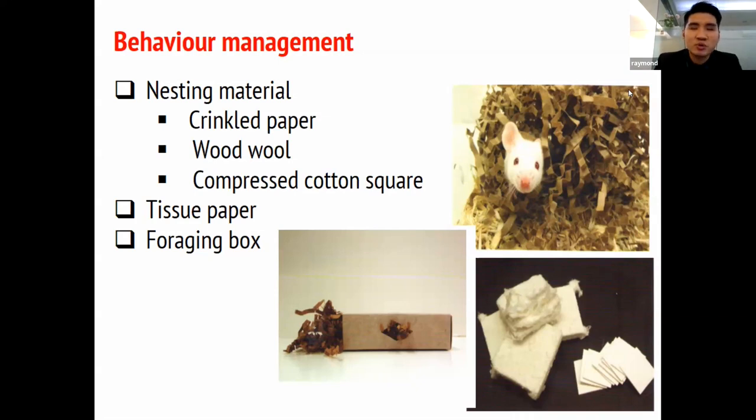So if we would like to make things a little bit better, you can also put those items into a foraging box. Just like in the image, this will increase the difficulty for them to take out the material. That would also increase the chances of them interacting with their environment as well. So all this can bring wild rodent behavior back to them.